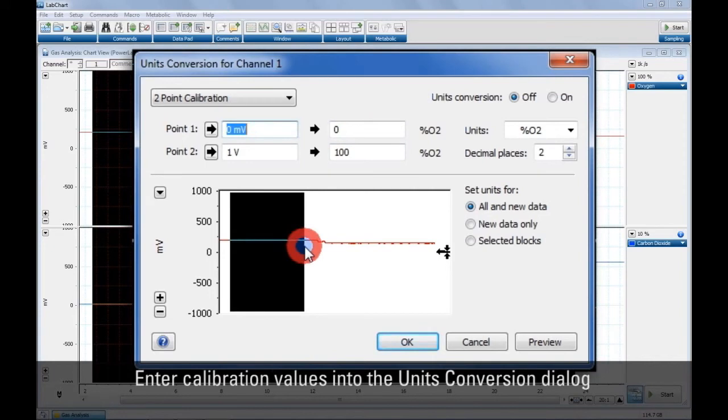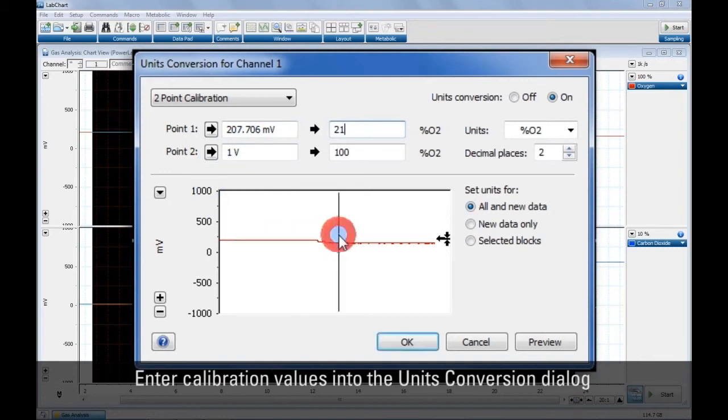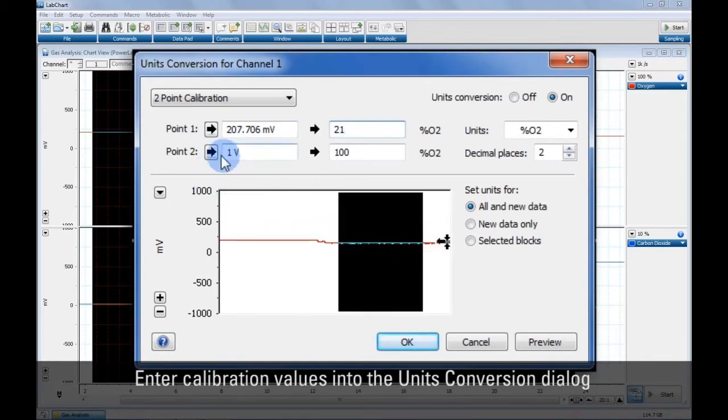Choose either carbon dioxide or oxygen from the relevant channel function pop-up menu to open the correct dialog. Enter calibration values into the unit's conversion dialog. Details on calibrating can be found in the LabChart help. Note that the Use default units checkbox in the carbon dioxide or oxygen dialog can be checked to restore the default conversion values.